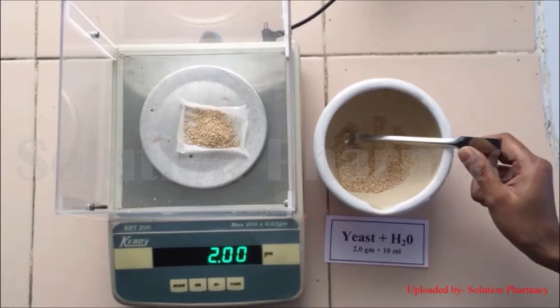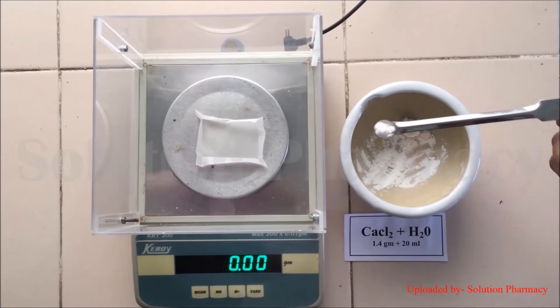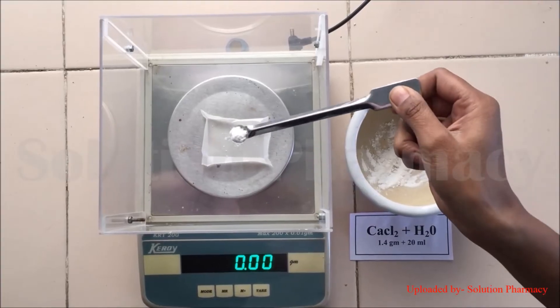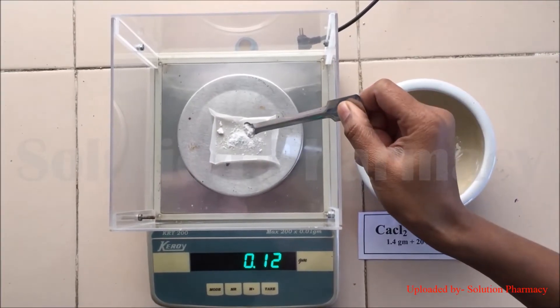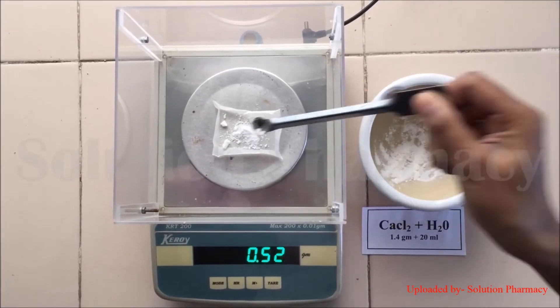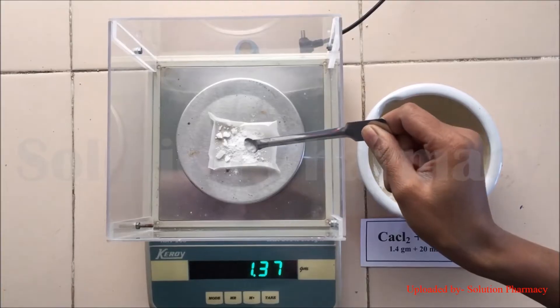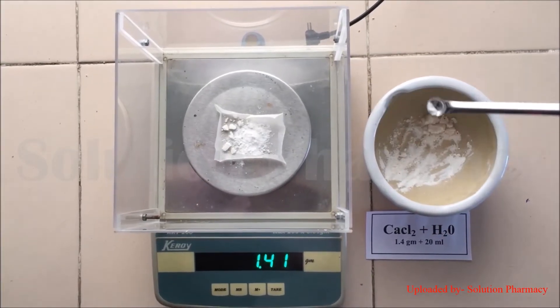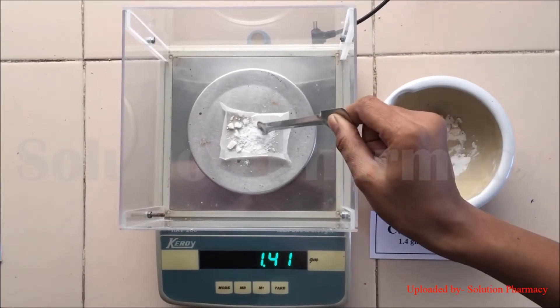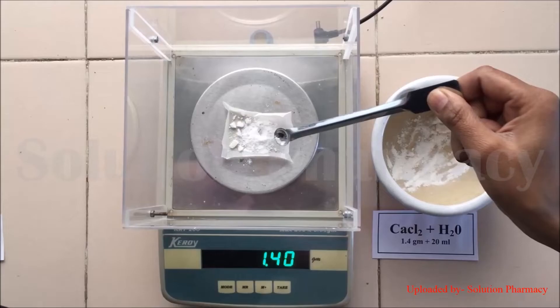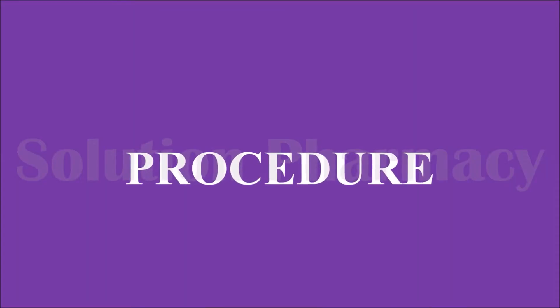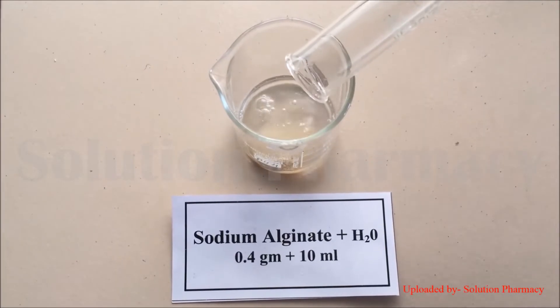Our yeast, which we purchased from the market, is in granule form, so we have crushed it in a mortar and pestle before weighing. After weighing the yeast, keep it aside. Then weigh calcium chloride — here we are weighing 1.4 grams of calcium chloride.